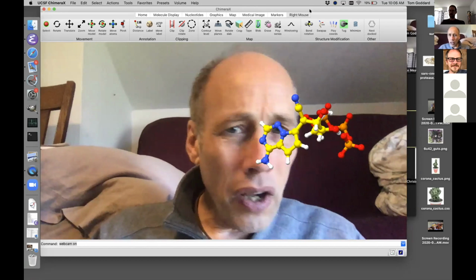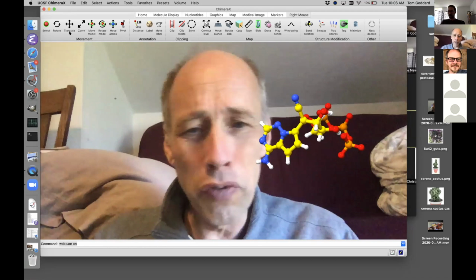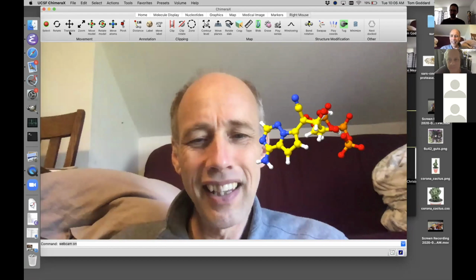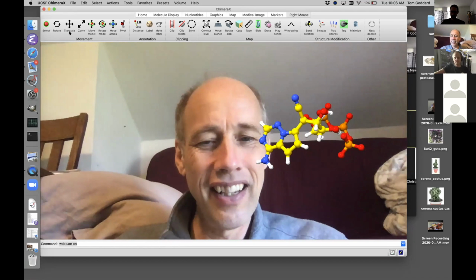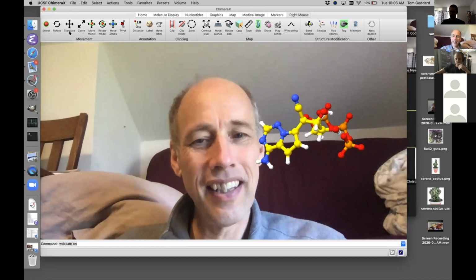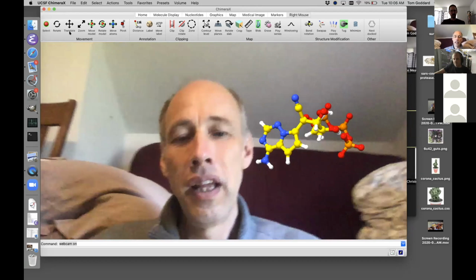Okay, are there any remaining questions, or do we have to end here because we're over time? We are a couple minutes over time. So we have one question from Elad in the chat, asking which menu do you activate the webcam under?